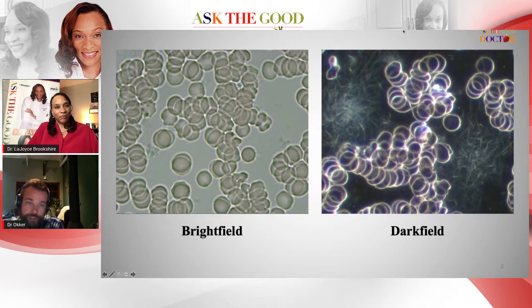We are able to see all these unusual anomalies in dark field that are not visible at all with a bright field microscope. And a bright field microscope being a traditional microscope. Absolutely. So your standard laboratory microscope would invariably be a bright field microscope, and there are other types of condensers and so on that you can get, but the standard type supplied with a laboratory microscope is bright field.